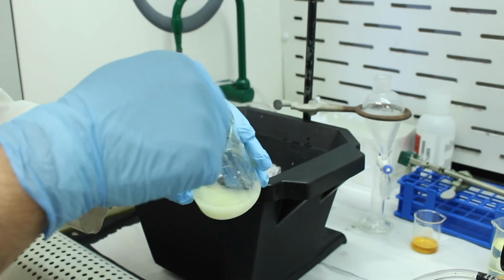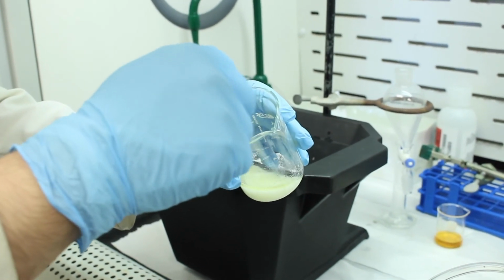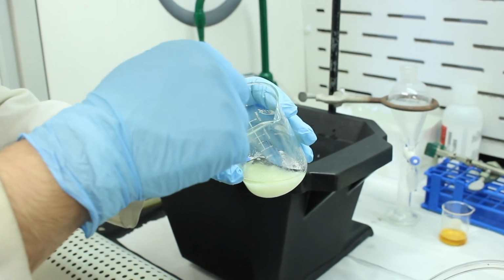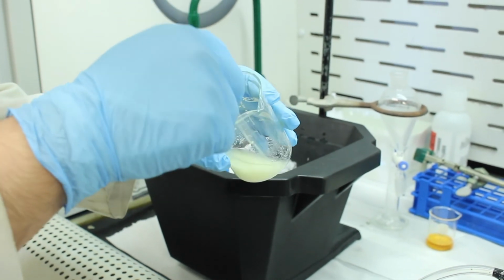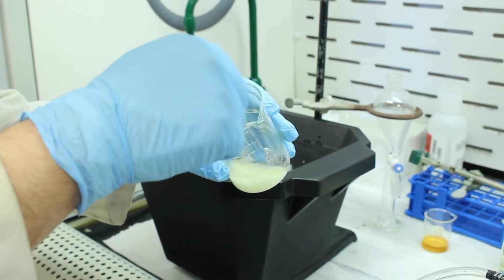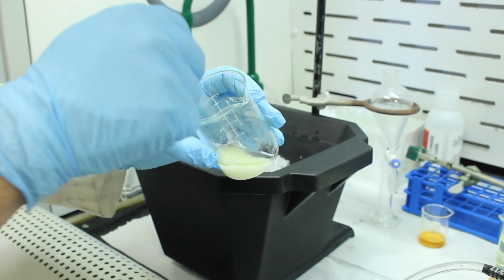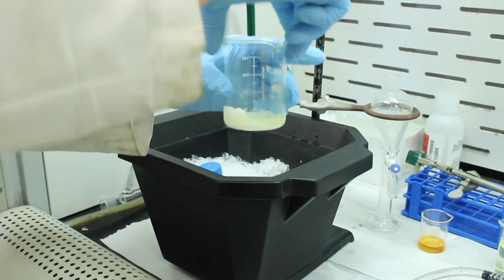So hexane, if you wanted to be really pedantic about it, you could say that hexane is the anti-solvent of triphenylmethanol, whereas ether is the solvent. So as the concentration of the anti-solvent increased, our triphenylmethanol began to precipitate, but our biphenyl is soluble in both. So that's what we get.